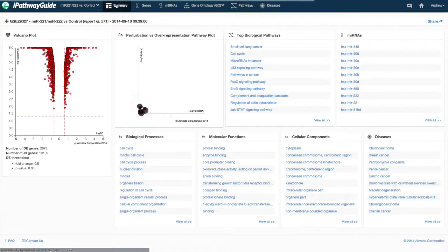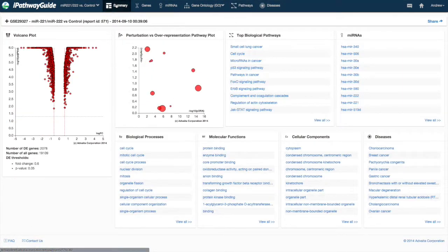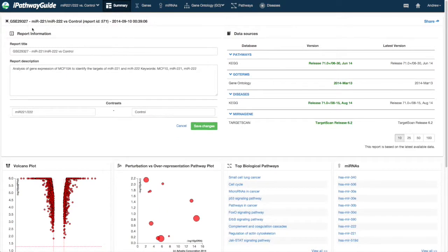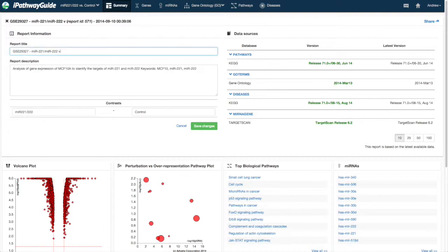If you wish to see detailed information about the report, click on the plus sign next to the title to expand the information about the experiment. Here you can edit or update descriptions and titles.